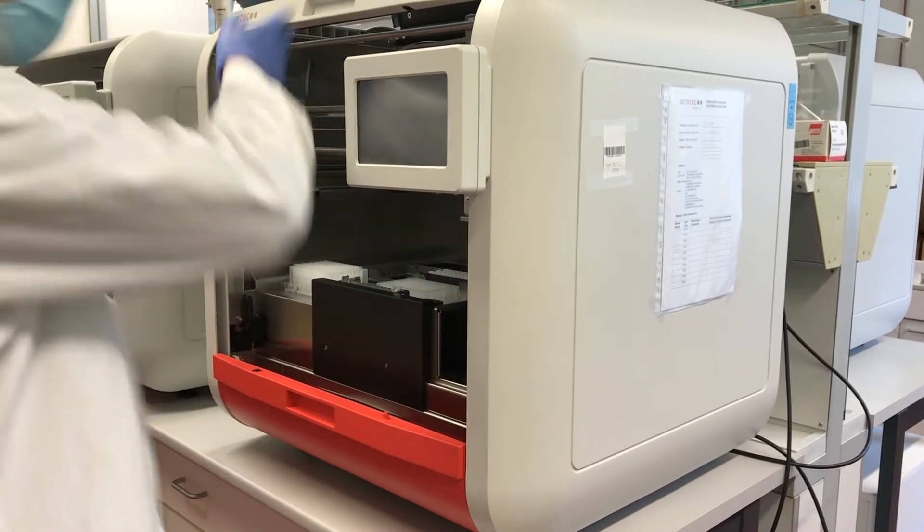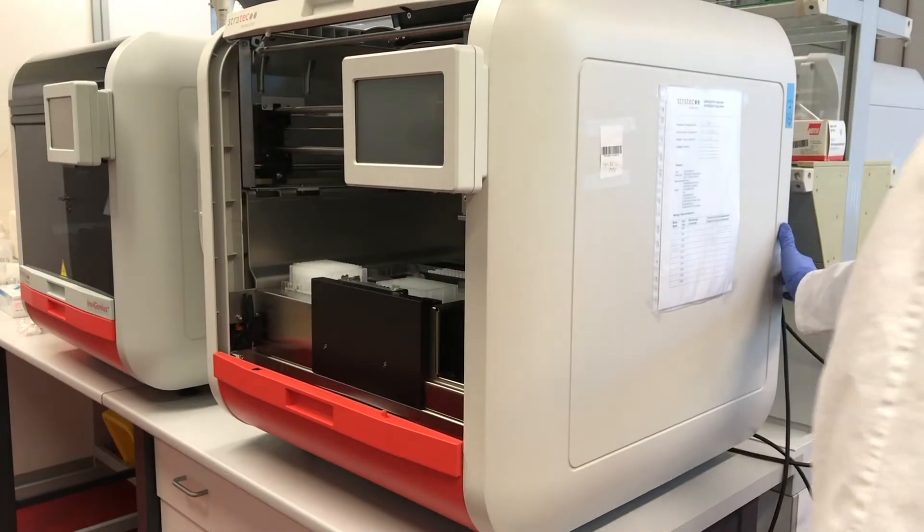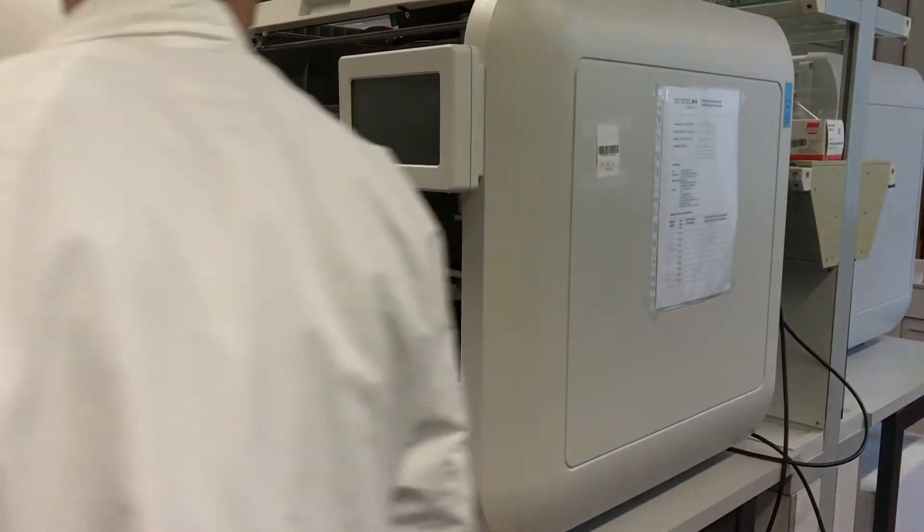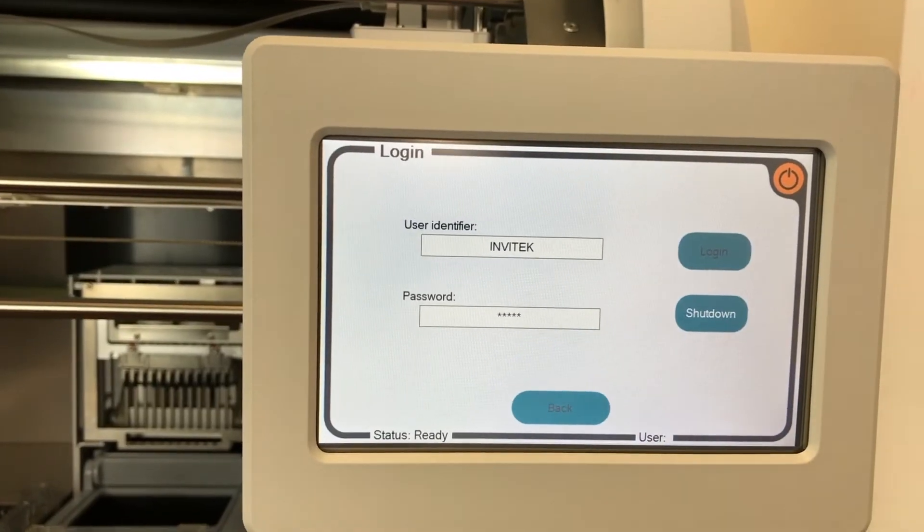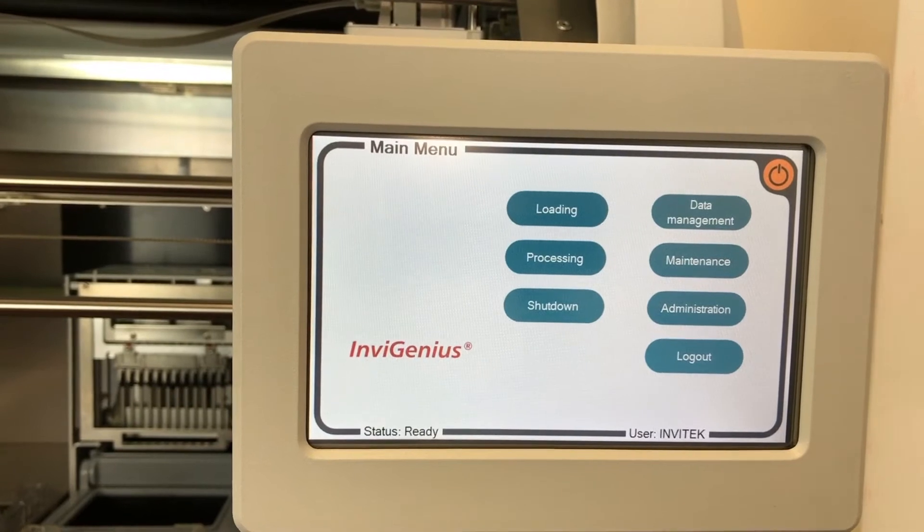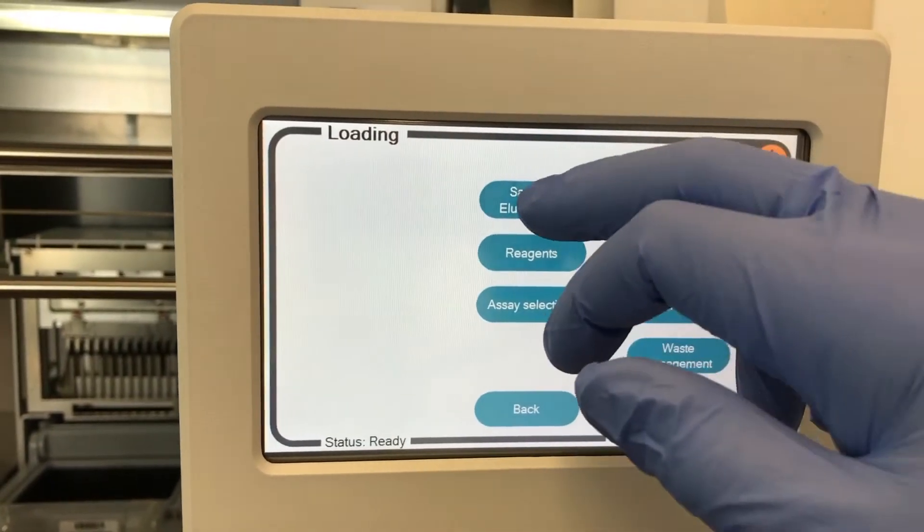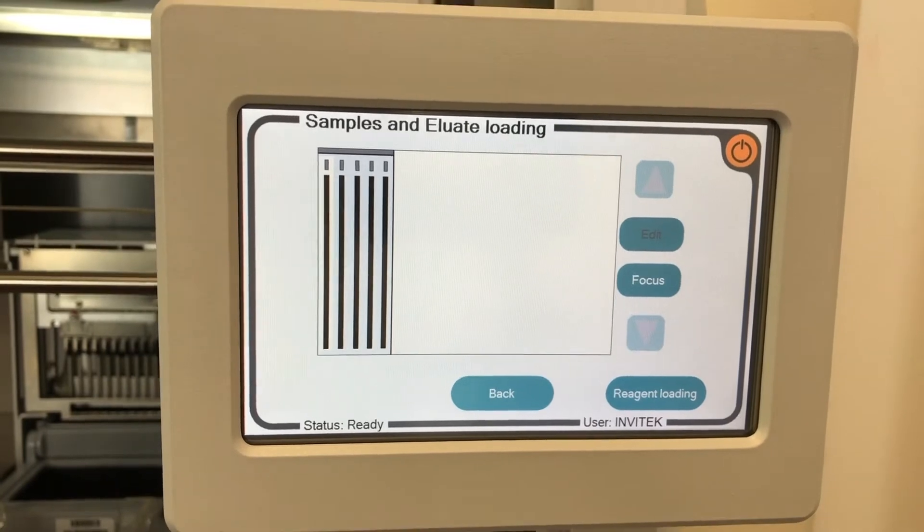The Invigenius allows the automated extraction of up to 12 samples with magnetic beads technology. Log in with your account on the integrated touchscreen. A step-by-step wizard guides through the instrument setup.